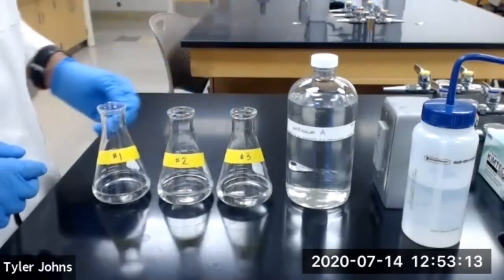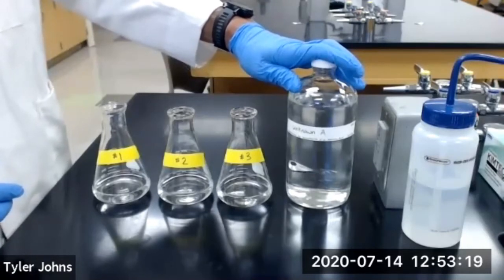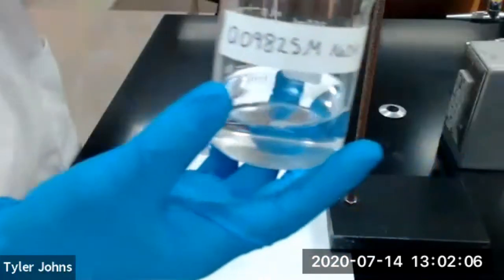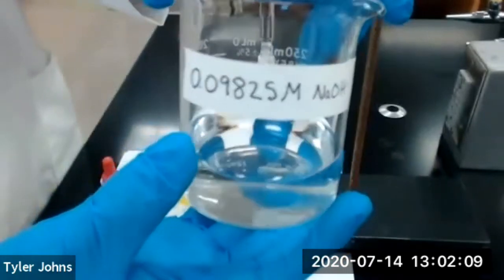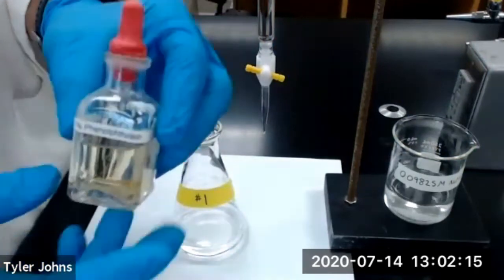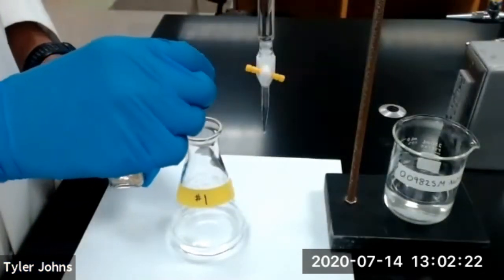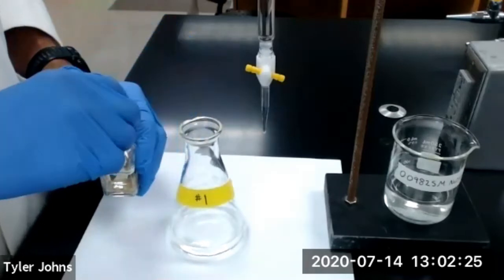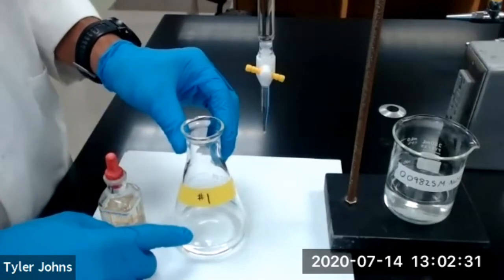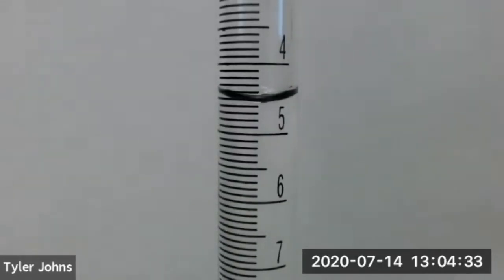We can now perform titrations to determine the concentration of our hydrochloric acid solution with an unknown concentration. We already have our burette set up which contains the sodium hydroxide solution that we just standardized. We will add three drops of our 1% phenolphthalein indicator to our Erlenmeyer flask and titrate to a faint endpoint. This is our initial burette reading for trial number one.